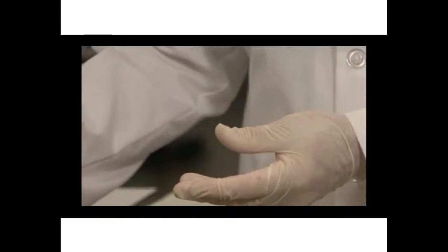Prior to equilibration, I will remove the IPG strip from the focusing tray and blot the excess oil off of the strip. First, pick up one end of the IPG strip, turn it over so the gel side is up, and place the IPG strip gel side up on a dry piece of filter paper. Wet another piece of filter paper and place the wet filter paper onto the IPG strip and gently blot the excess mineral oil off the strip.